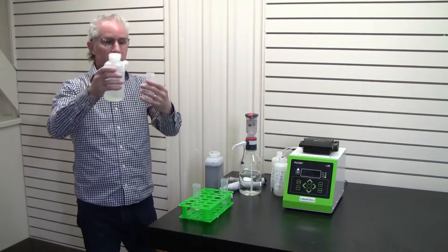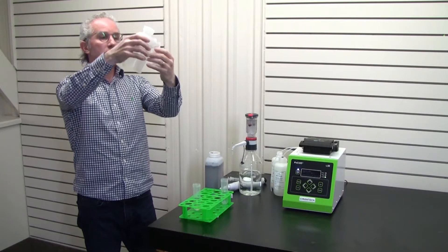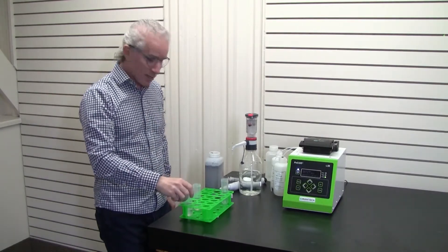With the distilled or deionized water, bring that up to 10 mils, just like so. Give it a little shake — we now have our diluted sample.